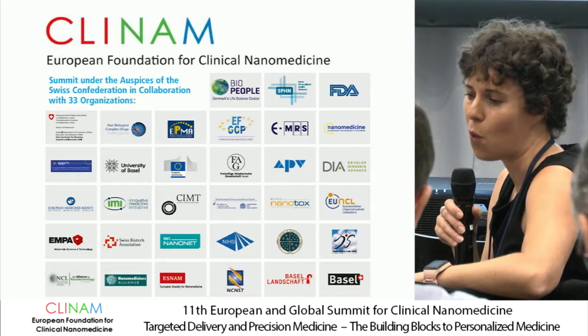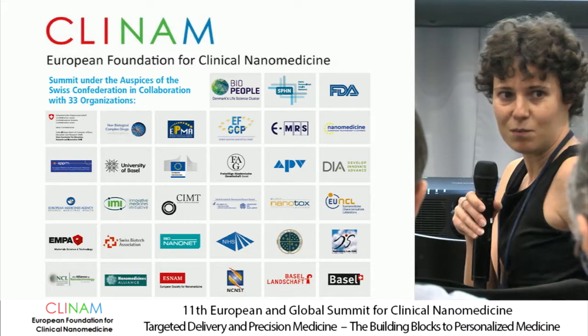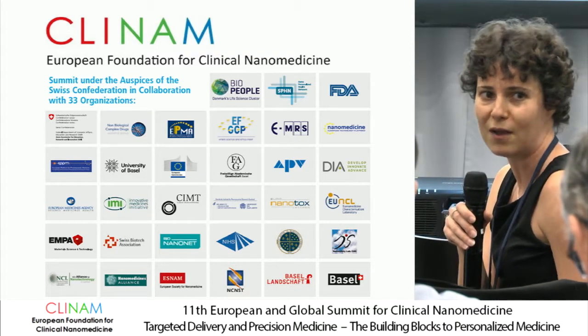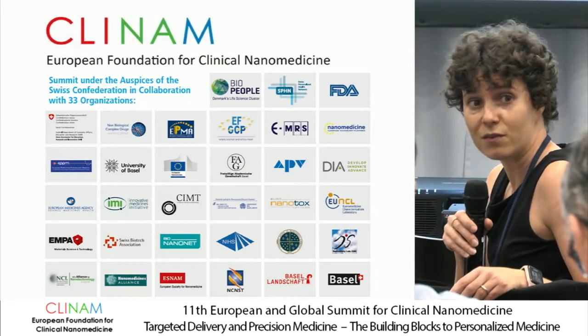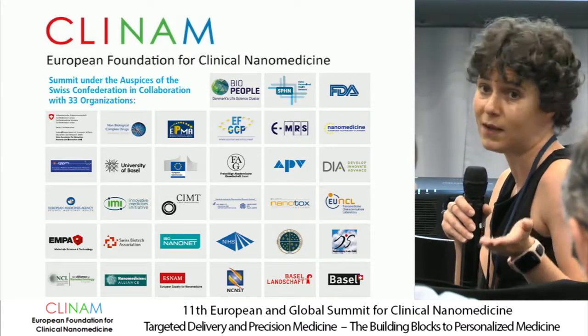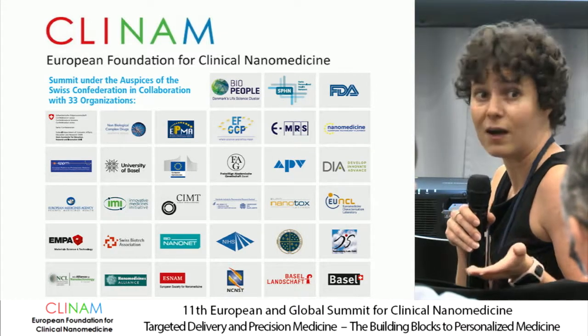If you don't know the mathematical analysis behind the calculation of the particle size distribution, how you derive different kinds of particle size distribution, and which parameters the system needs as inputs to properly calculate that, then of course you get wrong results.